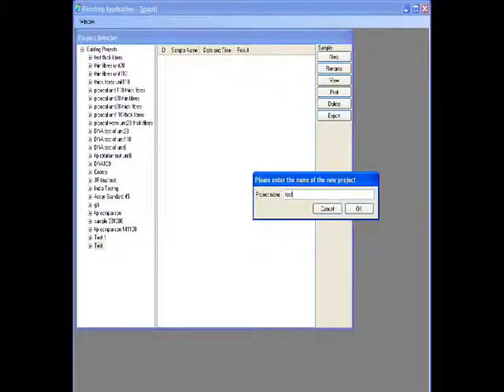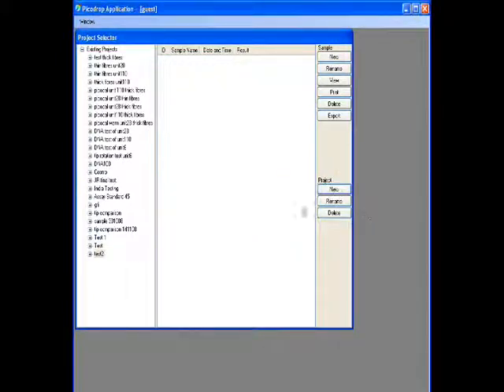Type in project name. The project will appear in the tree.